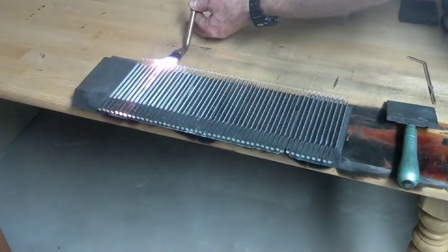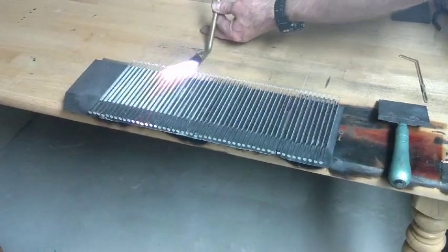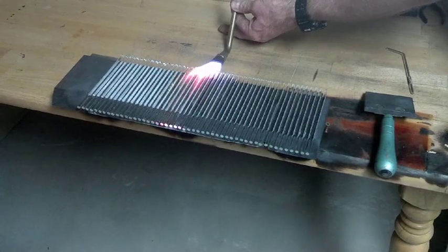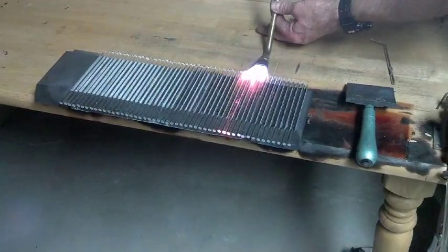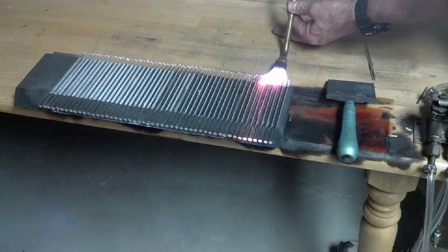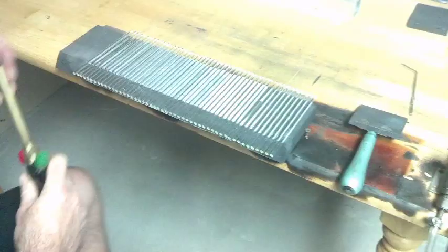Fire polish to the back side. Fire polish to the front.